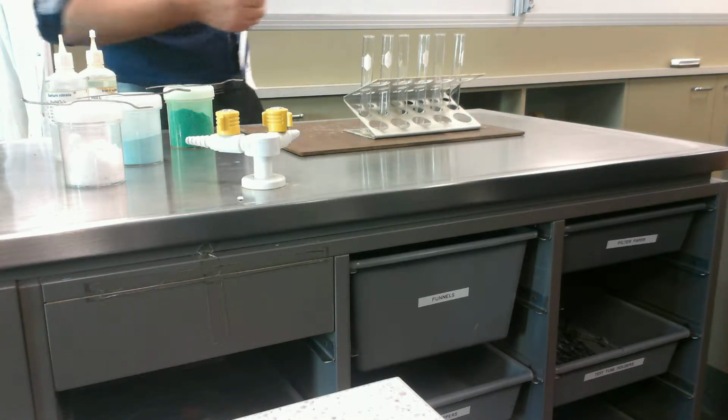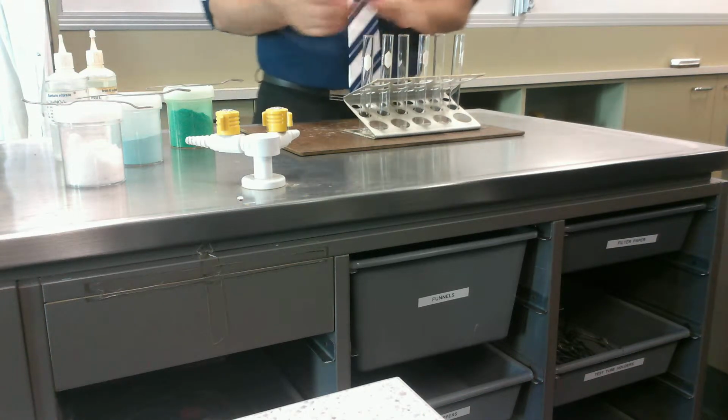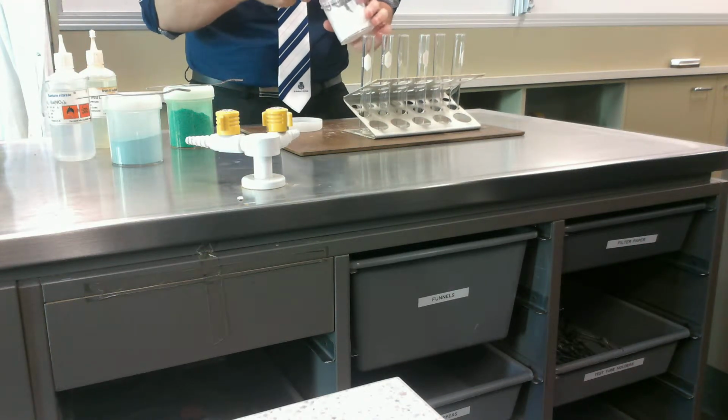So that's covered a lot of our keywords up on the board for you already. So if you weren't sure, you can check this video again later. Okay, I'm going to start with a pretty boring one. I'm going to have some magnesium sulfate. And the reason it's boring you'll see in a moment.